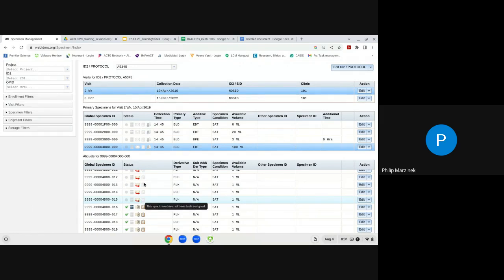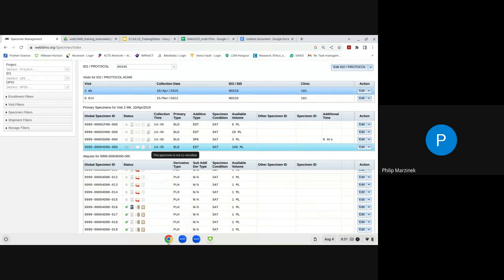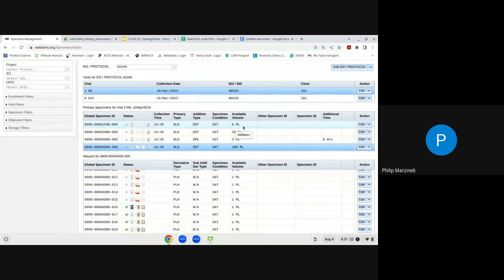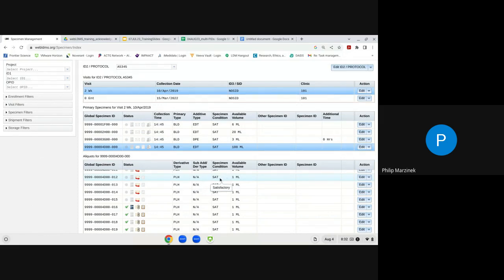The primary grid contains collection details including collection time, primary specimen type, additive type, specimen condition code, and available volume. The aliquot grid contains the derivative type, sub-additive derivative type, reagent information, specimen condition code, and available volume.